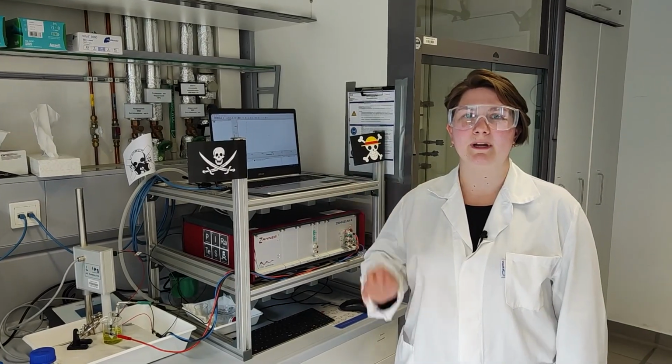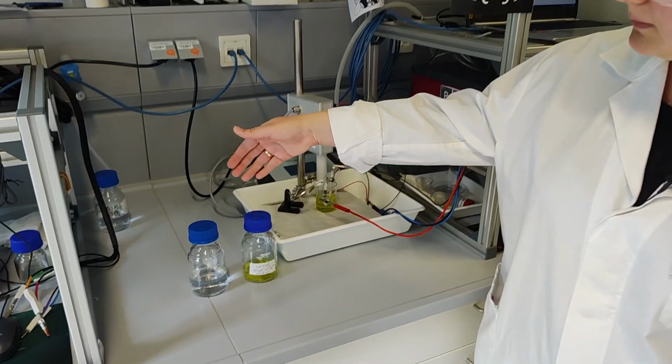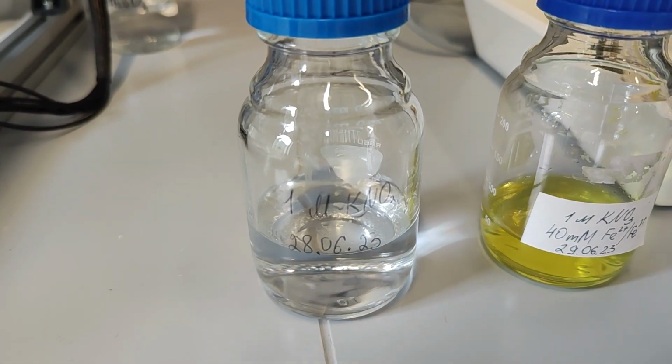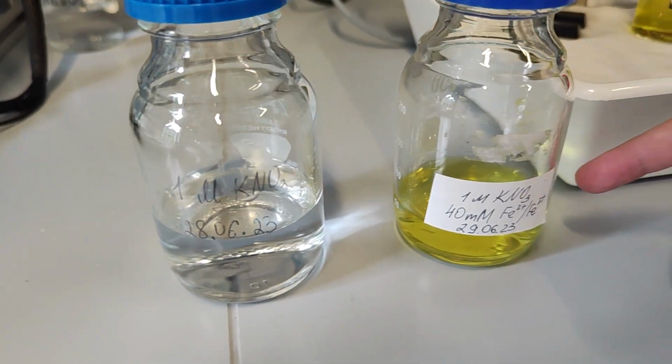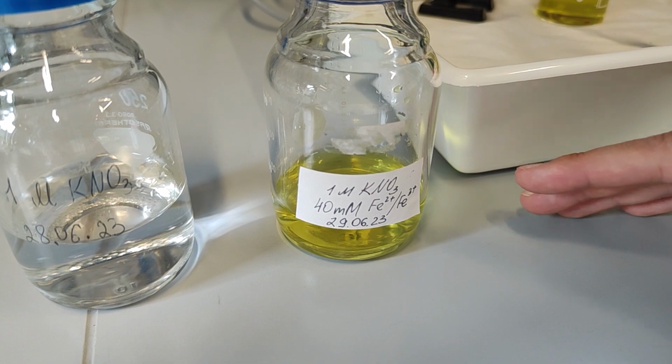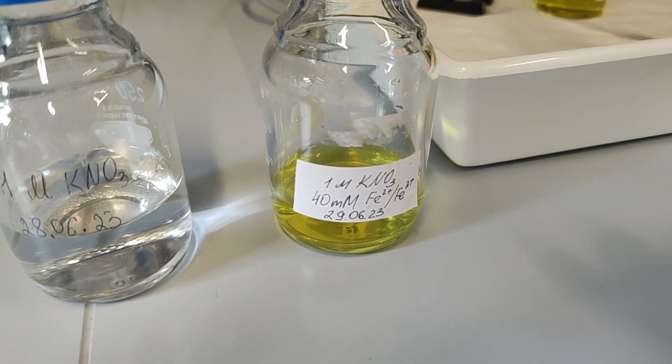Hello everyone, my name is Anastasia and I'm a PhD student in the SHAPE-EC group, and today I'd like to present you measurements of impedance spectra of the ferrocyanide redox couple. Let's start with the solutions that I prepared for these measurements. The first solution is a conductive salt of 1 molar potassium nitrate, and the second solution includes this conductive salt and 40 millimolar of the redox couple pair.